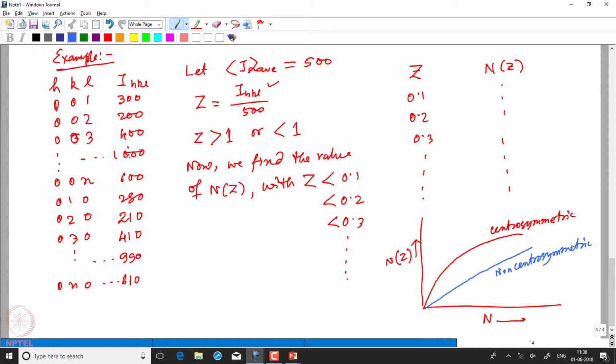And here at this point, I would like to just sensitize you that there may be something which is called hypercentric. The hypercentric structure means that there is no center of symmetry in the lattice, but there is a center of inversion in your molecule or in a pair of molecules which are there in the lattice.